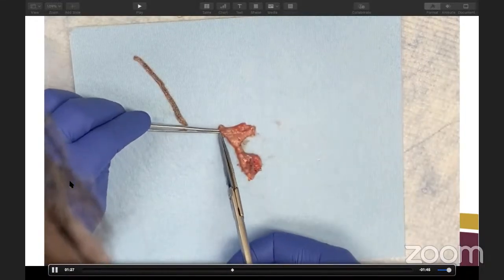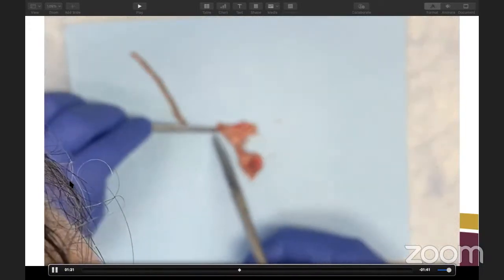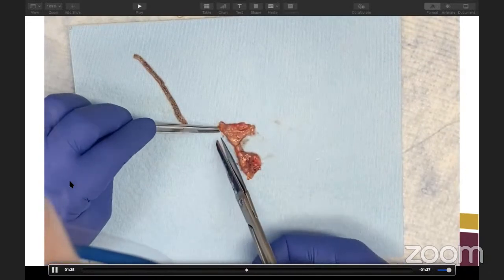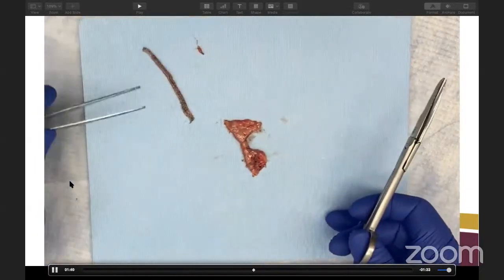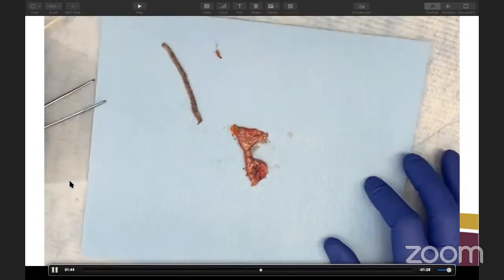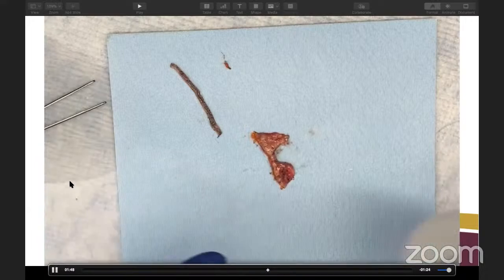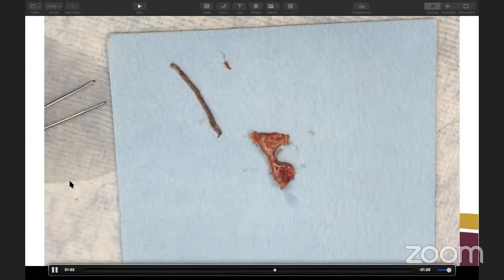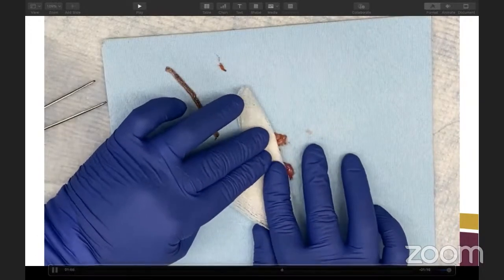All right, looks like I found another staple there. Trim that off real quick. Okay. Then the mordant, of course. And dry that off.